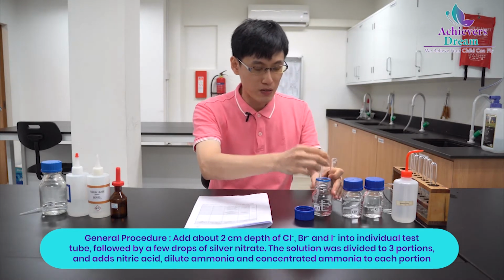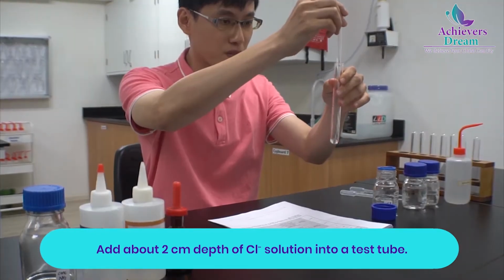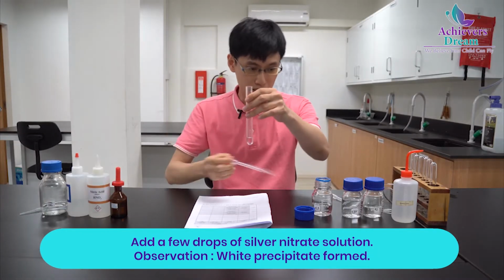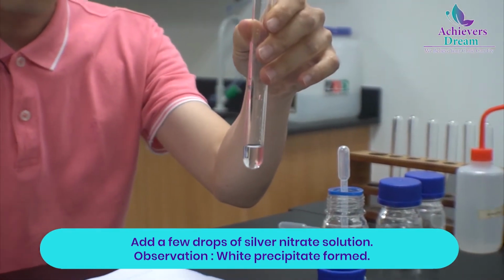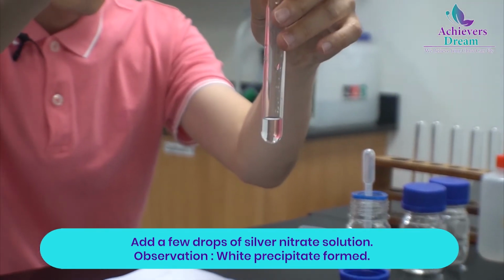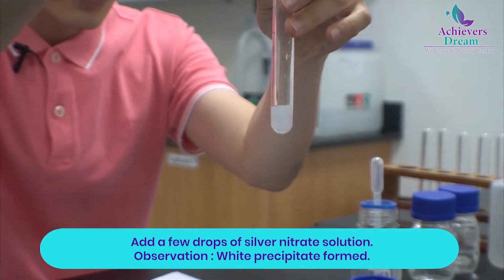I'm going to add about 2 cm depth of chloride ions to the test tube. As you can see, the solution is clear. So now we're going to add some silver nitrate and see what happens. As you can see, the solution is turning cloudy.